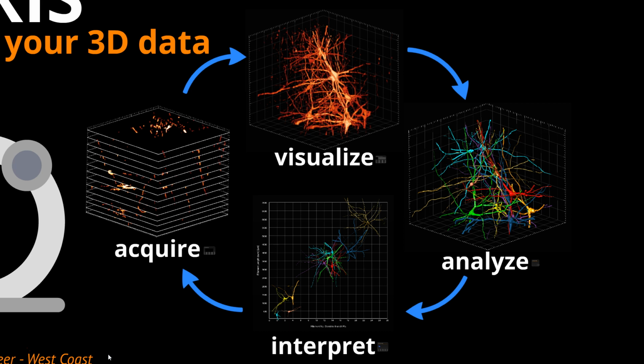I'm going to focus mainly on our analysis options because I believe that's probably why you're in the room today. So analysis is done mainly with modeling, so I'm going to spend some time talking to you about computerized modeling. And then lastly, I'm going to go over a little bit of data interpretation. So Imaris is going to give you the ability to collect a huge amount of data. And so I want to show you some new tools that we have to let you look at trends and similarities and differences between different data sets.